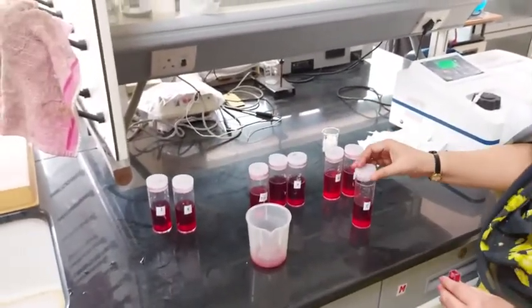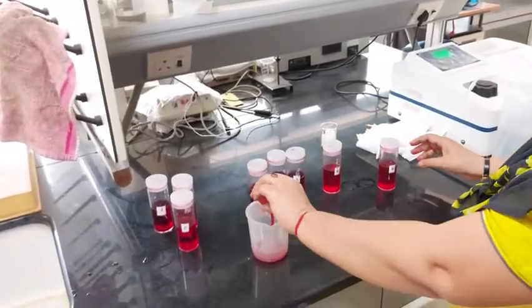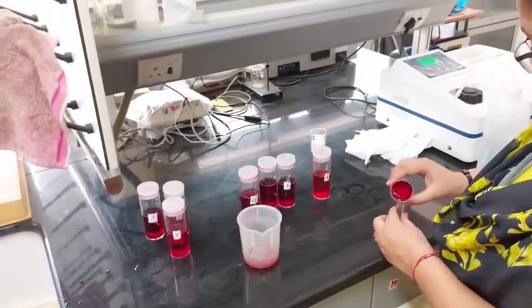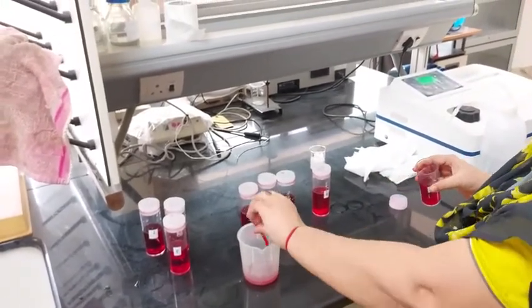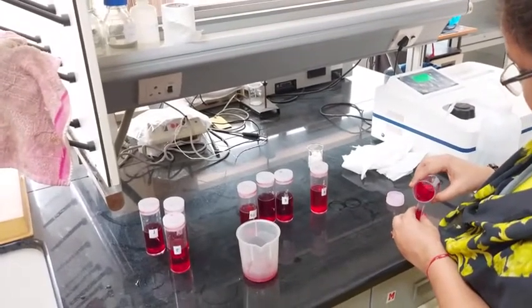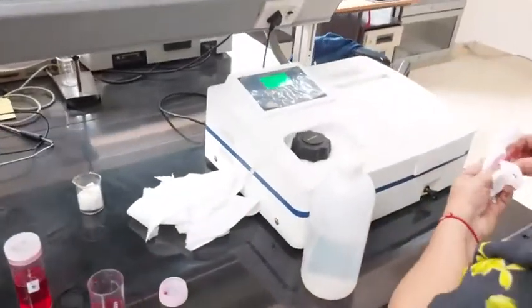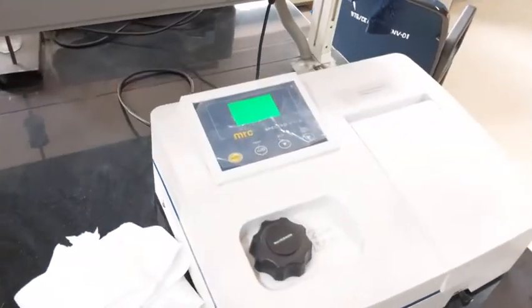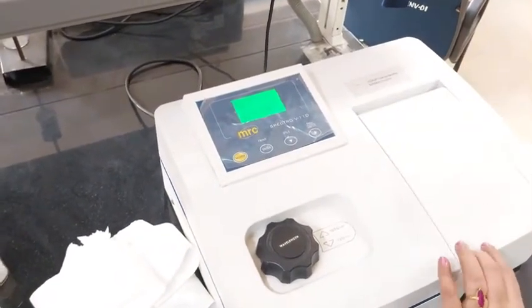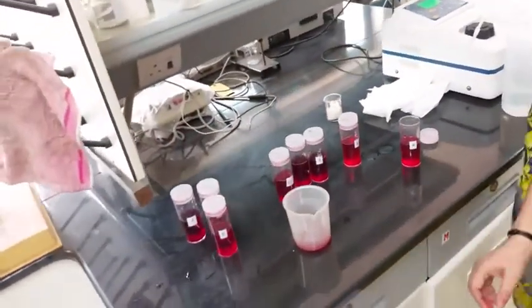The next standard is 1 milligram per liter. It is 0.966.